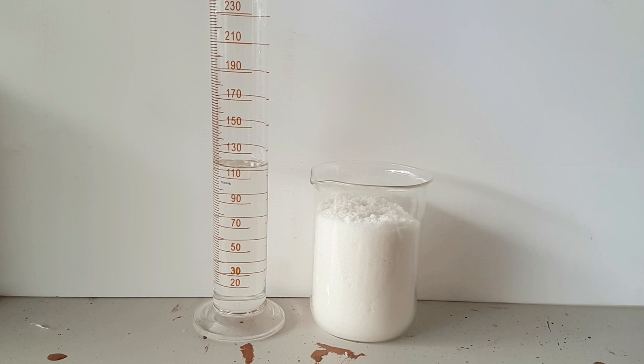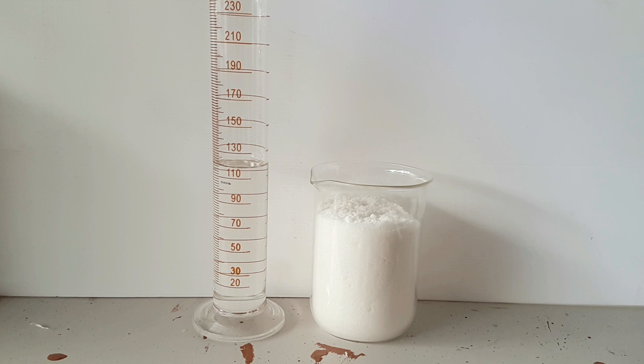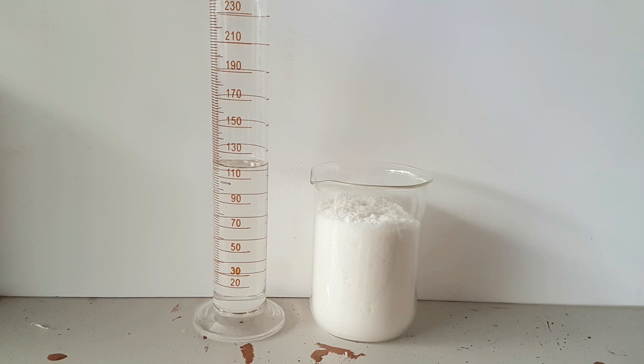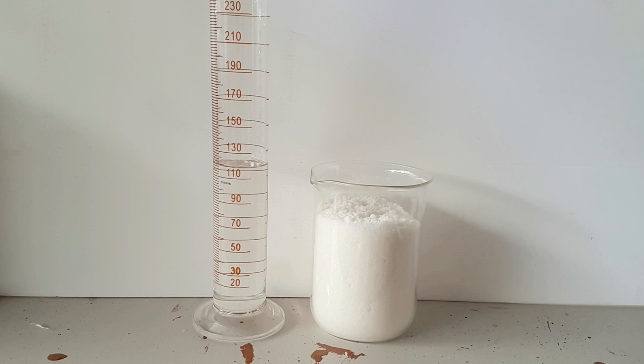For this project you'll need 200 grams of phosphoric acid and 500 grams of sodium nitrate. The formula will be shown on screen, and below in the comments I will put a link to where I buy my sodium nitrate.